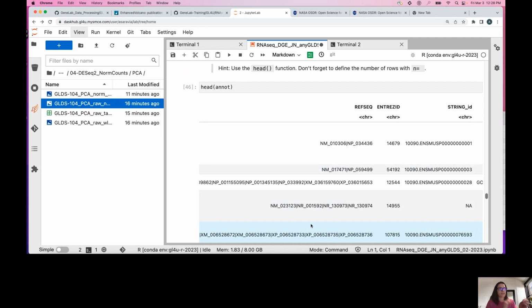We also have modified this. So if you remember before, I think the RefSeq ID was only one. So we would only take the first RefSeq ID, but there's a lot of RefSeq IDs associated with these genes. And so these RefSeq IDs could be a gene reference, it could be a protein reference. And so we decided, let's have all of them in here. That way you don't have to go looking for them for a specific gene. So they're all separated with a pipe.